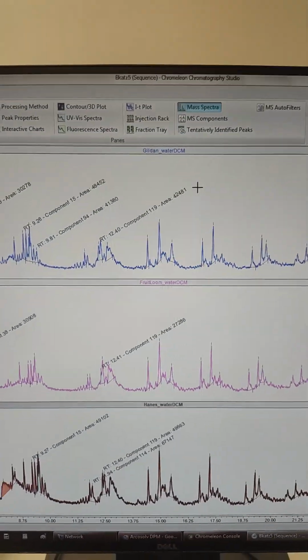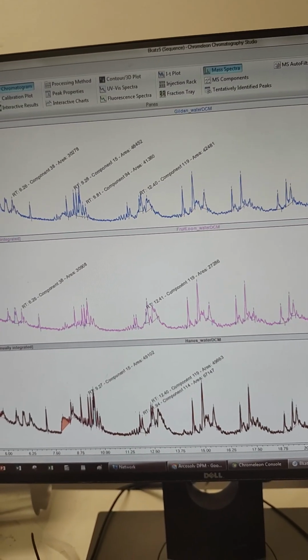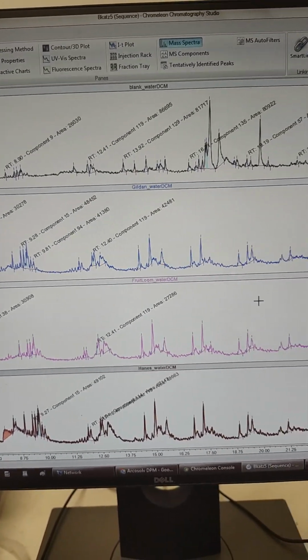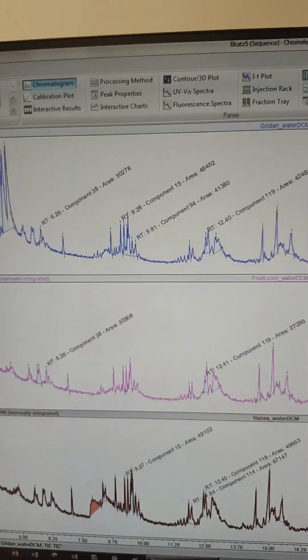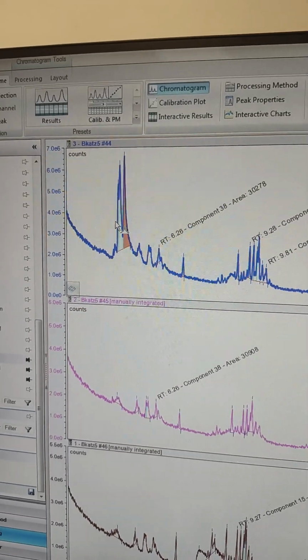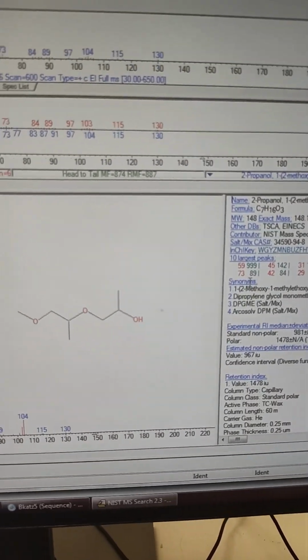We got the Gildan on top, the Fruit of the Loom in the middle, and the Hanes on the bottom. If you look at the blank, a lot of this stuff right there is all from the background. Just because you're extracting water, you see a bunch of other stuff. But we do have, in the Gildan specifically, a cluster of peaks, which we can identify. Send these to NIST. It is this ether.